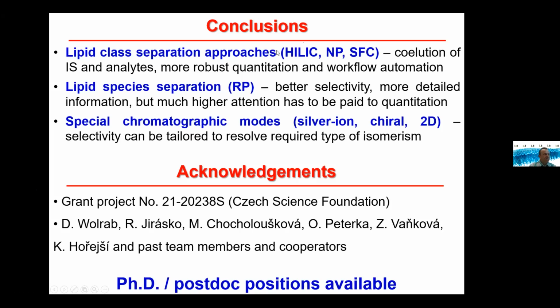If you imagine that you combine the benefits of lipid species separation and lipid class separation, this would definitely be the holy grail for lipidomic quantitation, but this is not available yet on the market, though we may see it in the future. And we also have some special chromatographic modes for dedicated types of isomerism with tailored separations.